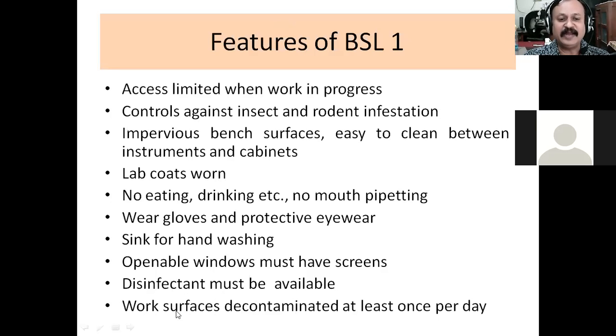Okay. And then the work surface must be cleaned with the disinfectant, or it should be decontaminated at least once per day. And if you have experienced this in your laboratory, then you might have cleaned your surface with the disinfectant whenever you were working in the laboratory. Just before the work, you clean the surface with the disinfectant, and then you start working. So these are most of the things you know already, but there may be something which is new here. So you have to know about that.